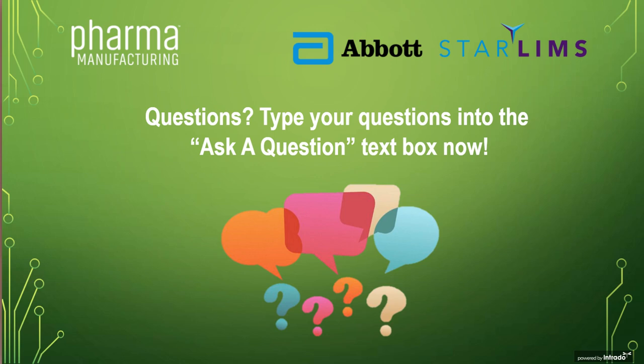Another question for either of you. How many system administrators do you recommend? Yeah, I can take that. So this is Sam. You would typically have one system administrator managing multiple systems, so it wouldn't just be STARLIMS. So typically you would have a prorated FTE when you're looking at the total cost of ownership. When the project is being implemented, in the beginning, that person would be more involved in setting the systems up and getting everything installed and ready to go. But then once it's ongoing, they would operationalize and handle the maintenance and management of that, and that would be part of their responsibilities in managing multiple systems.